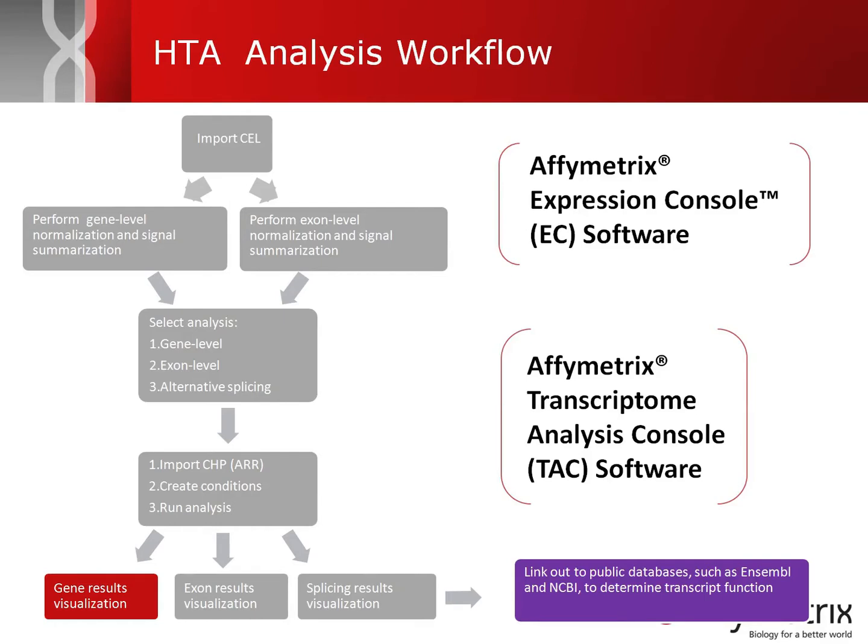The second software, the TAC software, or Transcriptome Analysis Console, which we'll be talking about today, does two things. It performs the differential expression analysis at either the exon or the gene level, and also does a similar thing for alternative splicing. Today we'll be reviewing results for the gene level analysis.